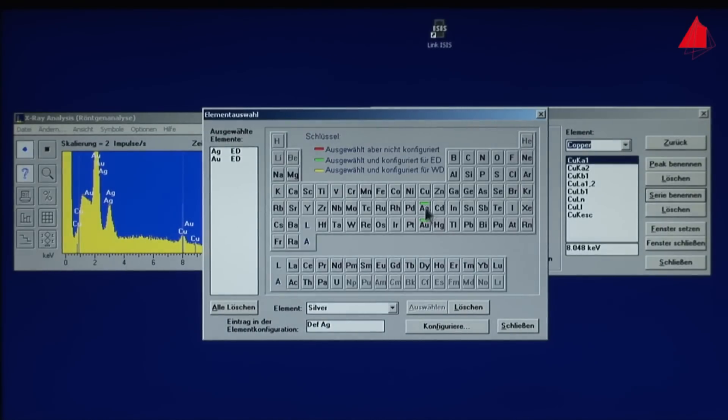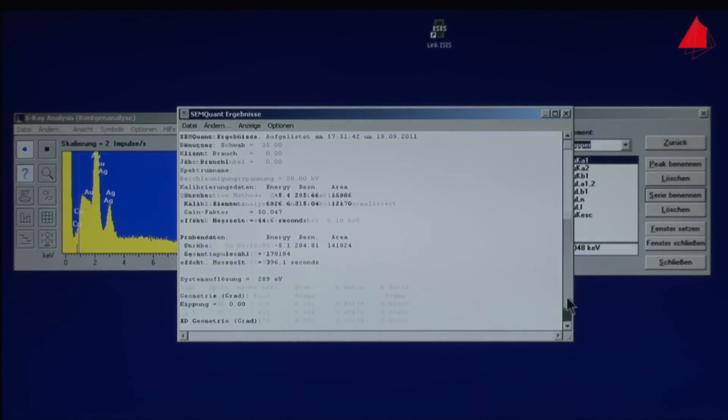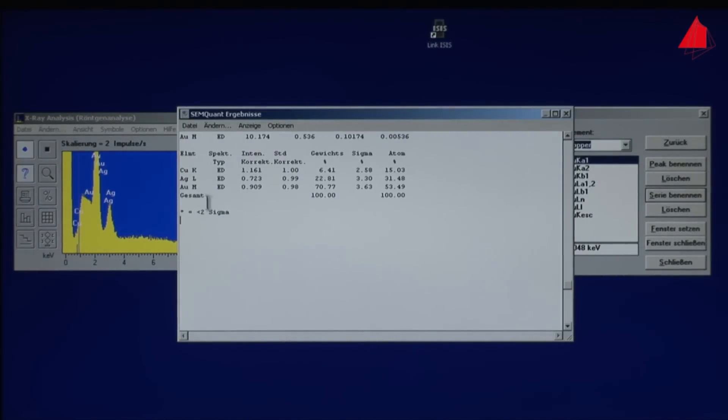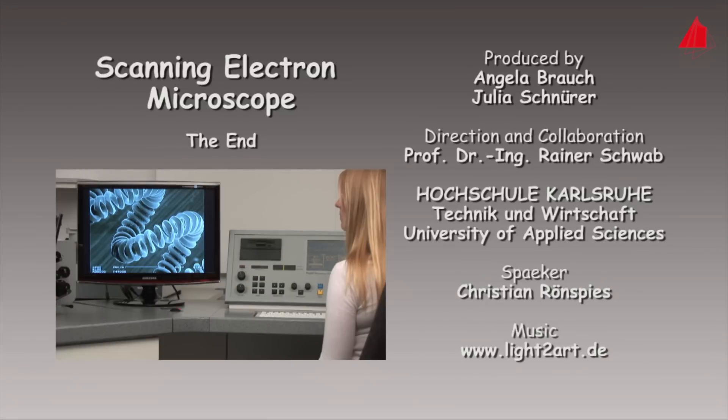The small cobalt plate was used to calibrate the measurement — that is, to adjust it finely. The chemical analysis is finished. The piece of jewelry is genuine: the gold content amounts to about 70%, with the balance being silver and copper.